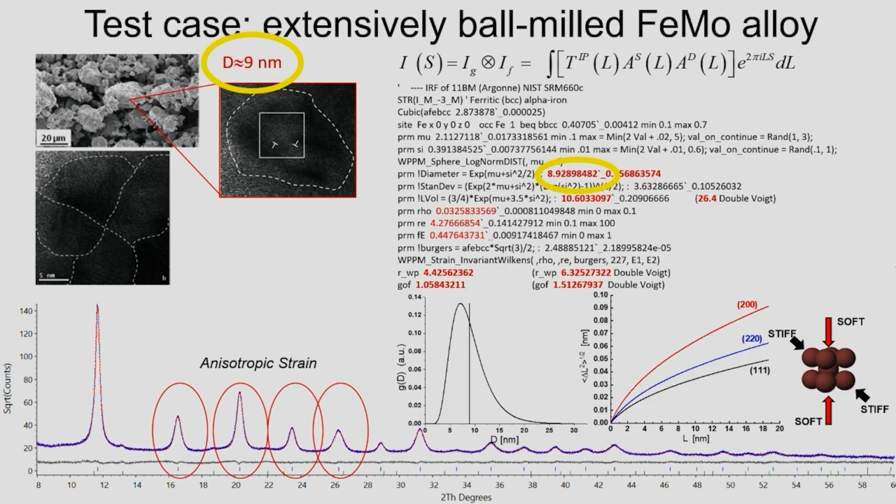I will tell you a little bit more about what use you can make of this model, which is something I have started using recently. And in this, there is one paper in particular I want you to look at if you want to learn more, which is a paper called the reference material for blah, blah, blah, blah. And it's based on data from ID22 and ID31 especially, and some lab instruments. So it's also a very nice comparison among different instruments.